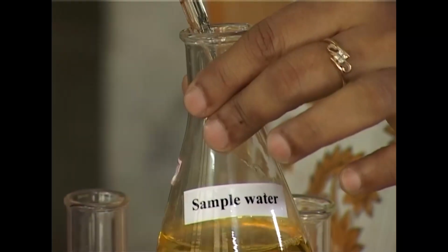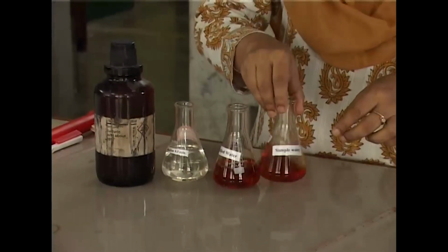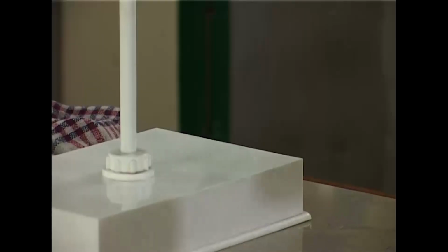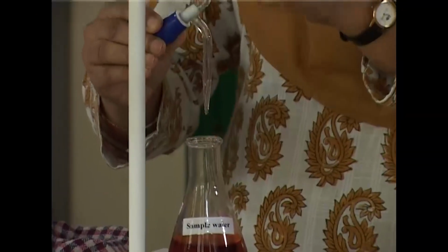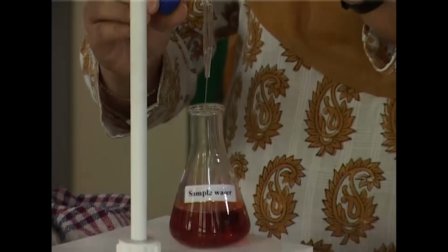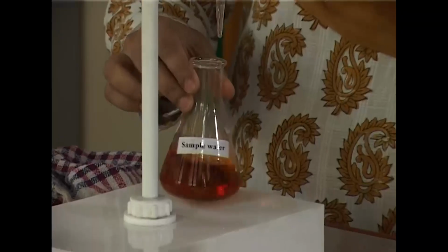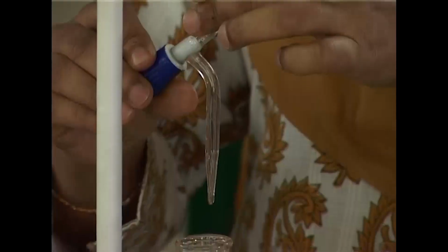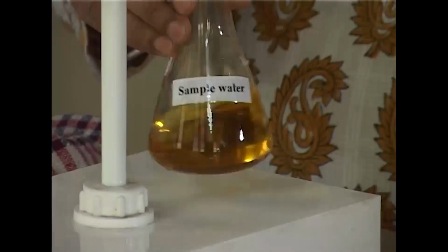Now these steps have to be done in both the flasks, the control and the one going on for the test. Now 0.1 molar sodium thiosulfate solution is taken in a burette and it is titrated along with the control and along with the water sample. And after the titration, we find that a pale yellow color appears.